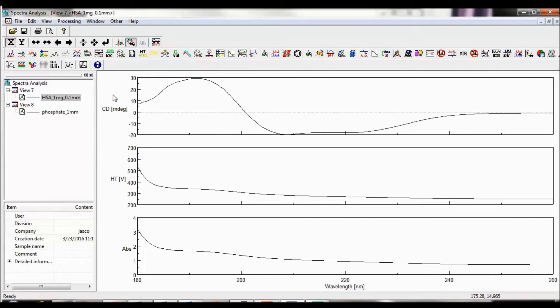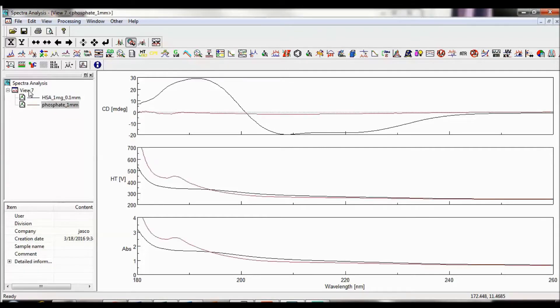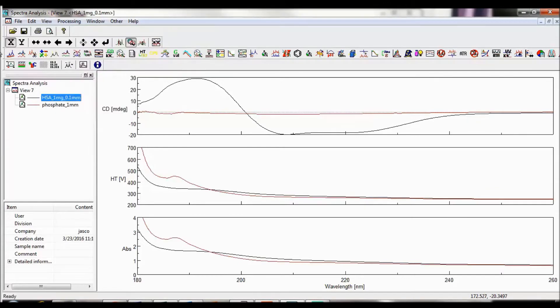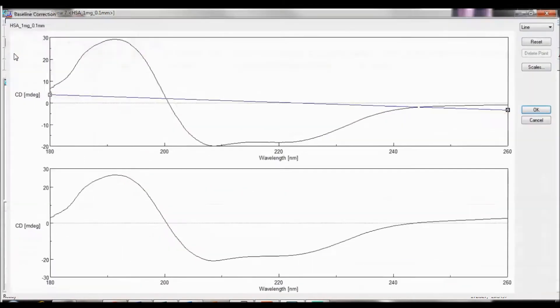The first processing tool is a baseline correction. First, make sure that the baseline spectrum is in the same view as the sample spectrum. Then select the sample spectrum. Either go to Processing, Corrections, Baseline, or select the Baseline Corrections icon in the Processing toolbar.